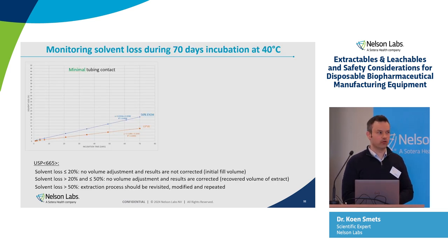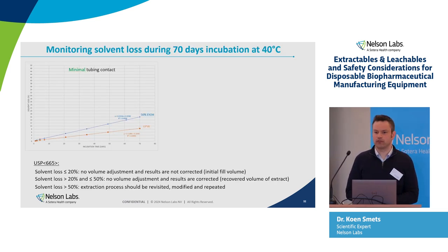Because we did not know the materials of construction of the bag system, we were a little bit suspicious, let's say, with regards to solvent loss due to evaporation, because we commonly encounter, especially for 50% ethanol extraction solvent, that there is a considerable solvent loss for some plastic materials. So in order to deal with this, we decided to measure the weight of the filled test item at different stages during the incubation.